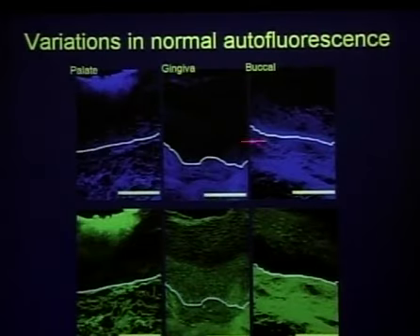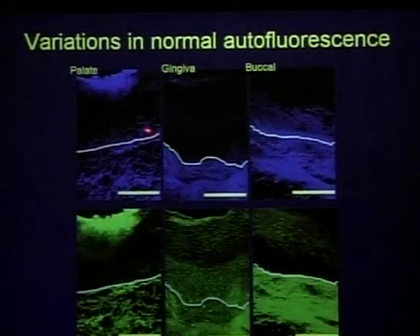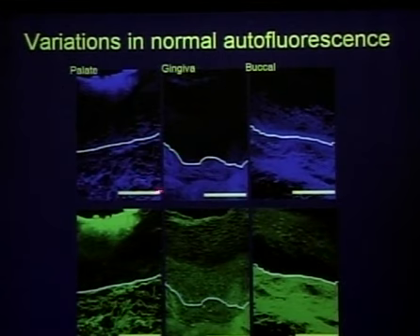And what I show you now are fluorescence confocal images of living slices of tissue. The top row shows these images with UV excitation. This is an argon at 351 to 364, and here with 488 nanometer excitation. And we've drawn a white line here to indicate the basement membrane. So above that is epithelium, below that is stroma, and the scale bars here are 200 microns.